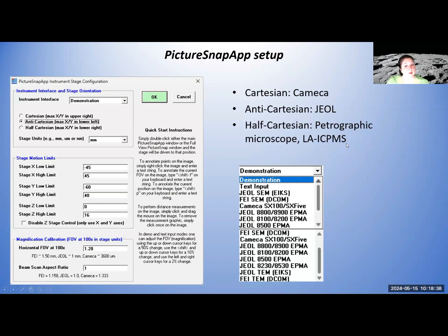And so if you're in text annotation mode, you have to make sure that it's set up to what you want to digitize, and then when you take it to a different instrument, you can just transform these coordinates so that they are working for a microprobe or wherever you took it, or vice versa.